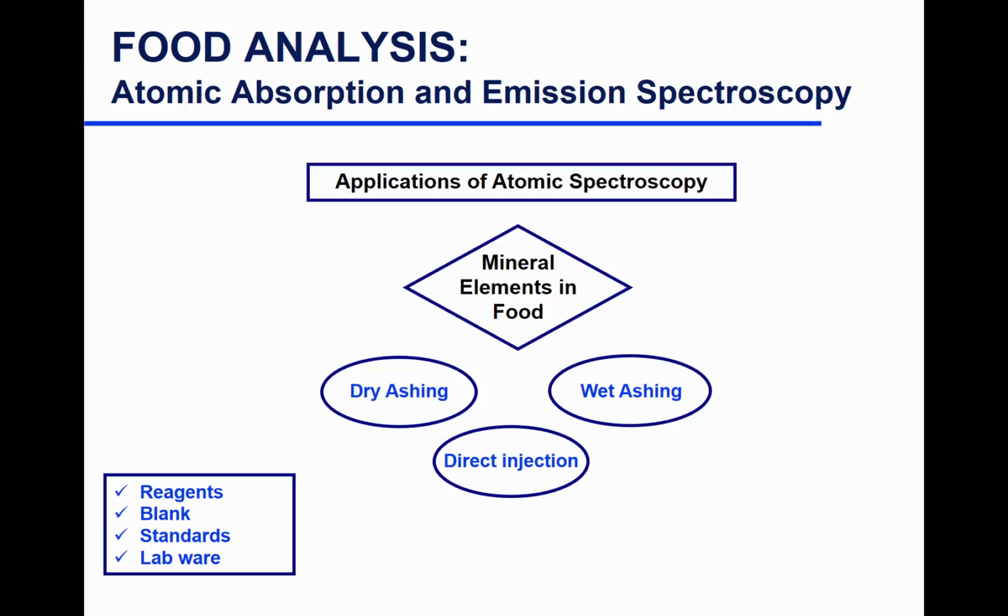So they spent hours washing all of the labware with acid. They're all acid washed to solubilize any residual elements or minerals in the glassware before you actually use them in the lab. And the crucibles that are also used for ashing have all been acid washed before putting samples in them and ashing them in the muffle furnace.